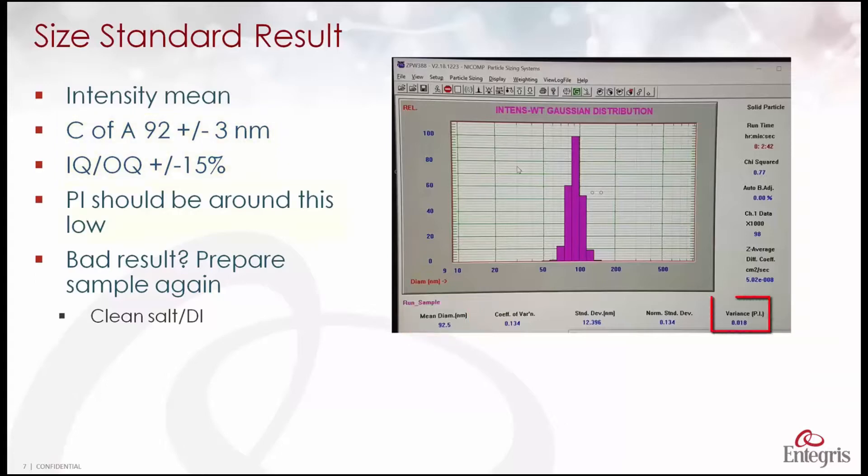The number you see here, the variance or PI which stands for polydispersity index, that number should be very low like we see here.